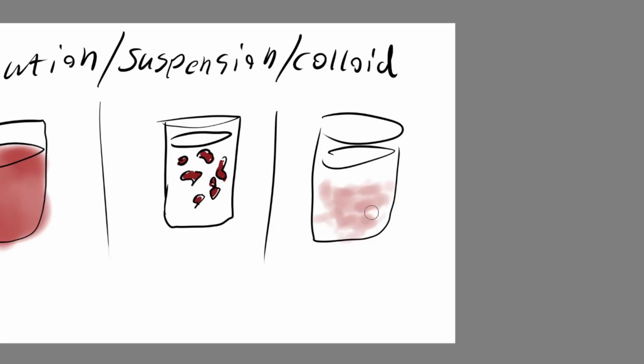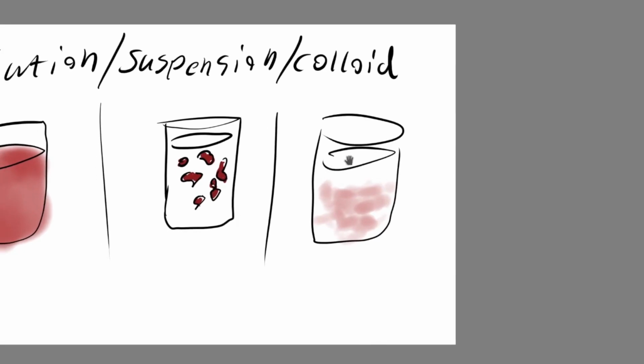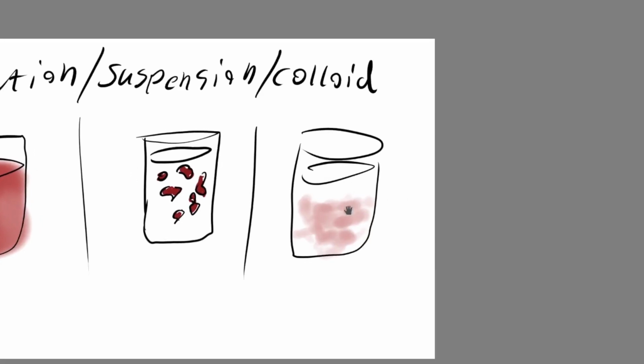And when we turn metal into a colloid, you get this metal that looks like a fluffy cloud suspended in the water, and it doesn't mix with the water, though you can get it to a point where, for example, if you look up colloidal gold, it's pink if it's weak and it's red if it's strong, because it's so heavily suspended in the water and mixed into it that it looks like a solution, but apparently it's not. It's still a colloid, so it's still tiny little pieces of gold mixed in with this.